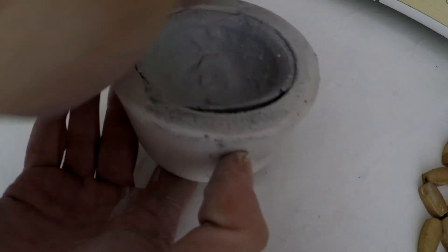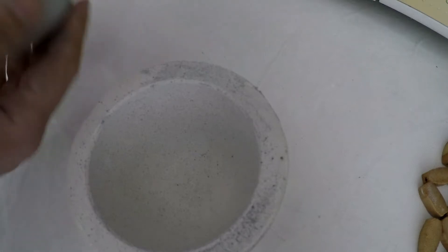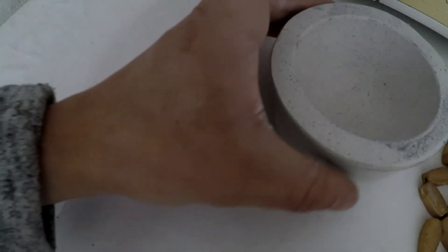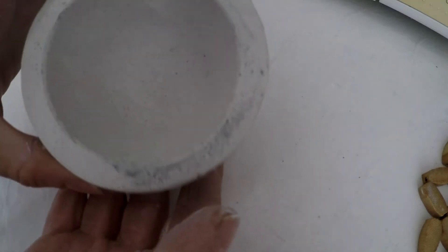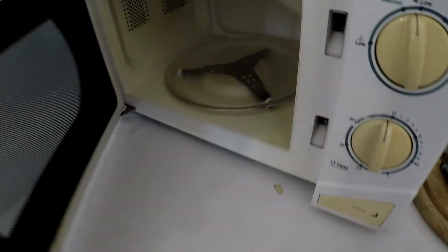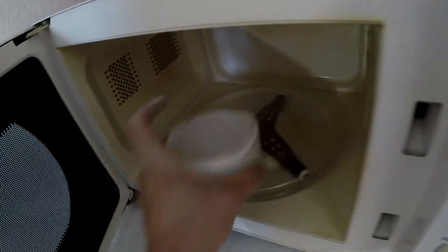After you can see the separation between the slip and the mold, just flip it upside down and it'll pop right out. You can see the insides are kind of ugly but as I said I don't care. Again, while the plaster mold is still wet, I'll put it into the microwave for four minutes on medium-low heat.